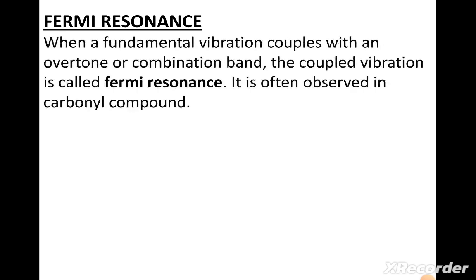Further, we will study another important topic of infrared spectroscopy, which is Fermi resonance. Now, what is Fermi resonance? When a fundamental vibration couples with an overtone or a combination band, the coupled vibration is called Fermi resonance. It is often observed in carbonyl compounds.